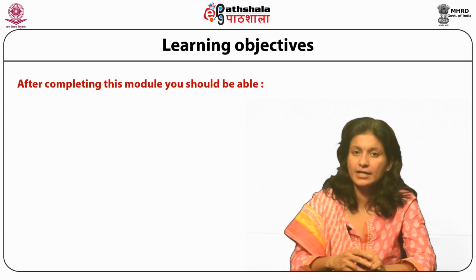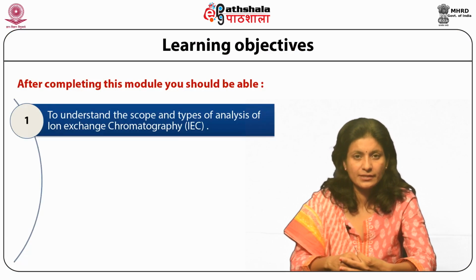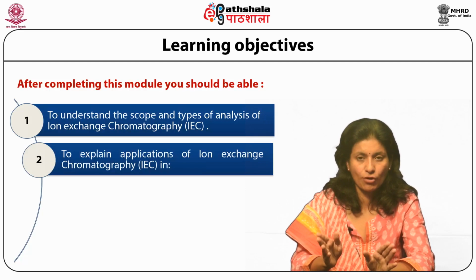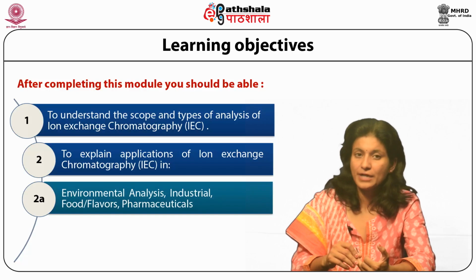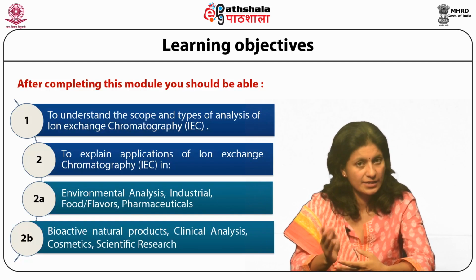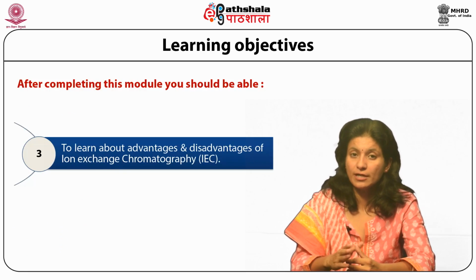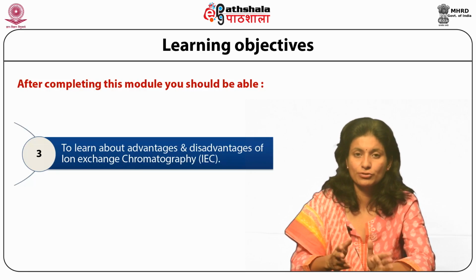Students, let us see what we are going to learn in this module: to understand the scope and types of analysis of ion exchange chromatography, to explain applications of ion exchange chromatography in environmental analysis, industrial, food flavors, pharmaceuticals, bioactive natural products, clinical analysis, cosmetics, scientific research, and to learn about the advantages and disadvantages of ion exchange chromatography.